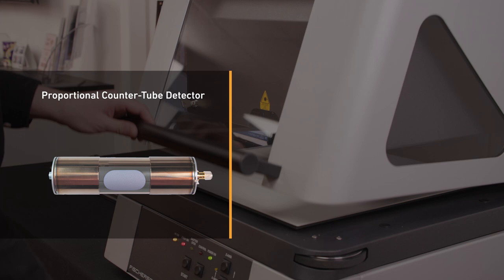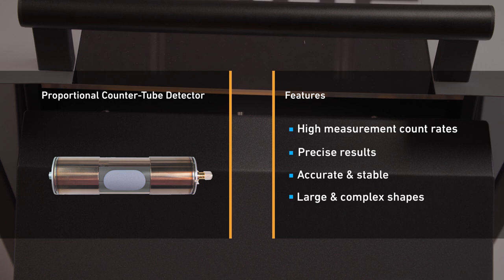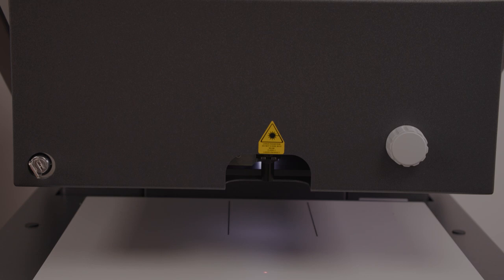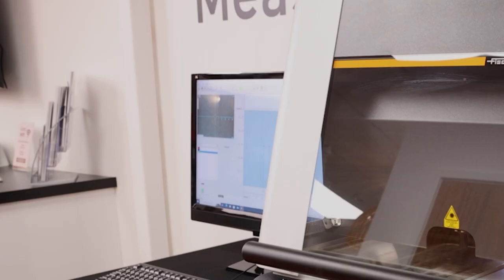The XDL instrument range benefits from a proportional countertube detector with a large X-ray capture area, producing high X-ray spectrum count rates and excellent precision, even at long measuring distances. This detector can be distant from the measured surface to accommodate large or complex shapes, a significant advantage over silicon-based detectors that must be close to the sample to be effective.